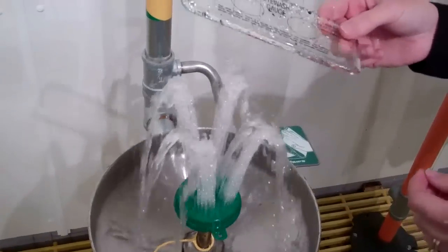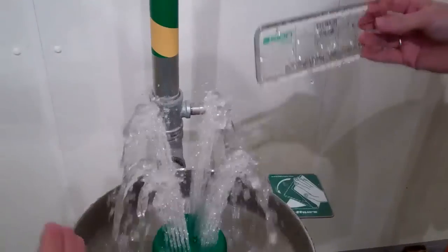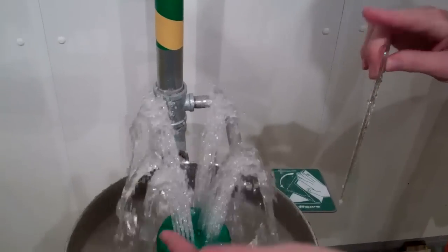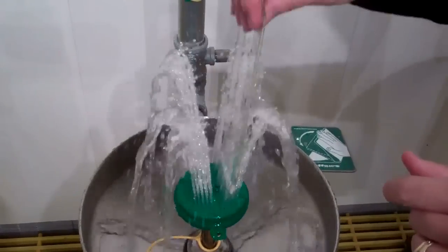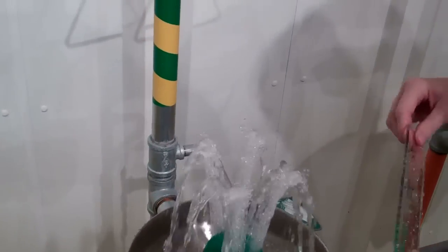The eyewash gauge on typical eyewashes is also used to separate the water flow so that you make sure that your flows on either side are good. But with the new Axian MSR, because we have the inverted flow, it's going to drench you from the inside out. You don't have to worry about that — you're not going to have any one side overpowering the other. So that's a great feature about the Axian unit.